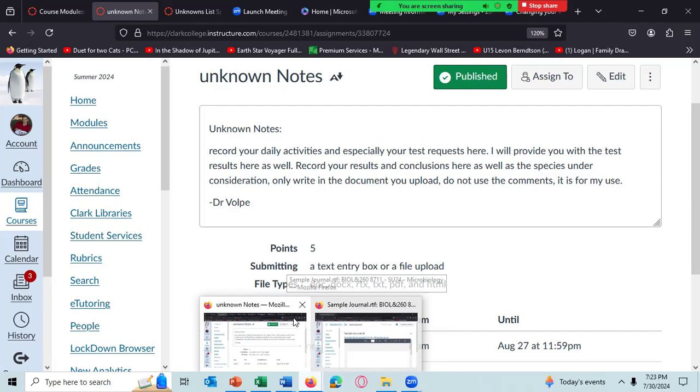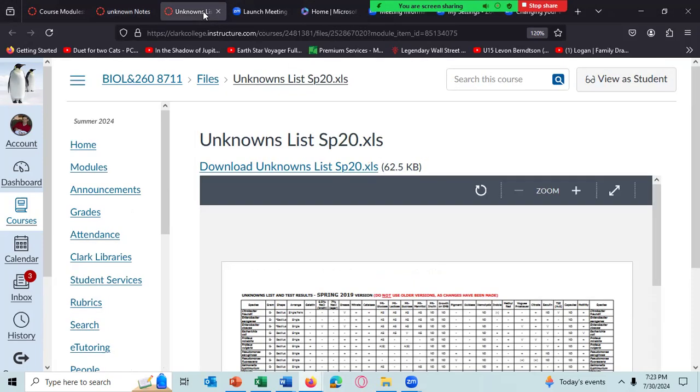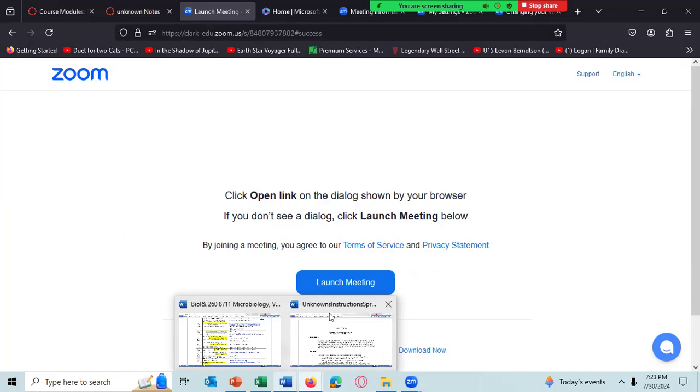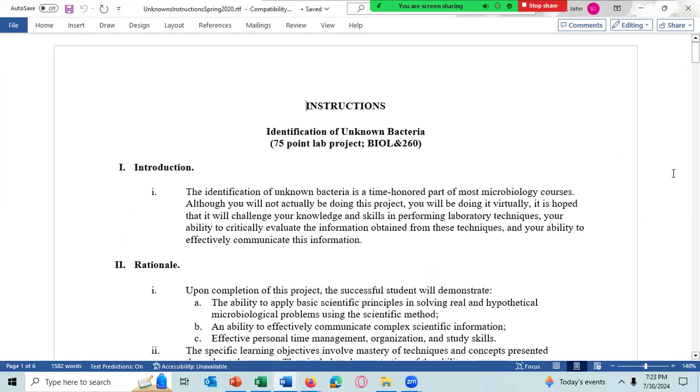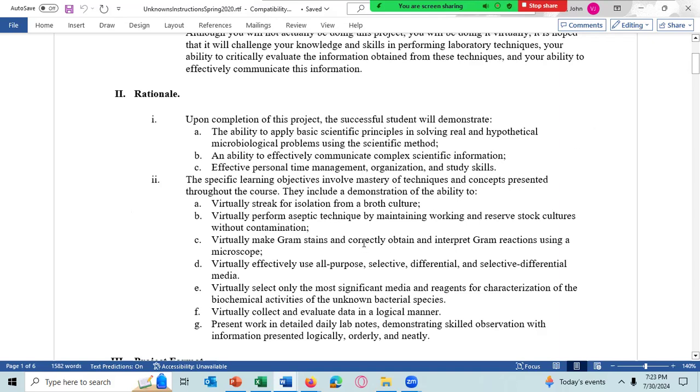Yeah, and the document here, let's go to that. Remember I said you're going to pretend to do some things? We're not actually going to do them because this is an online class. If you were in a real lab, you would streak out the bacteria and send it through 2 colony isolation events, and then take the cells from one colony that went through 2 colony isolation events to set up your pure culture.